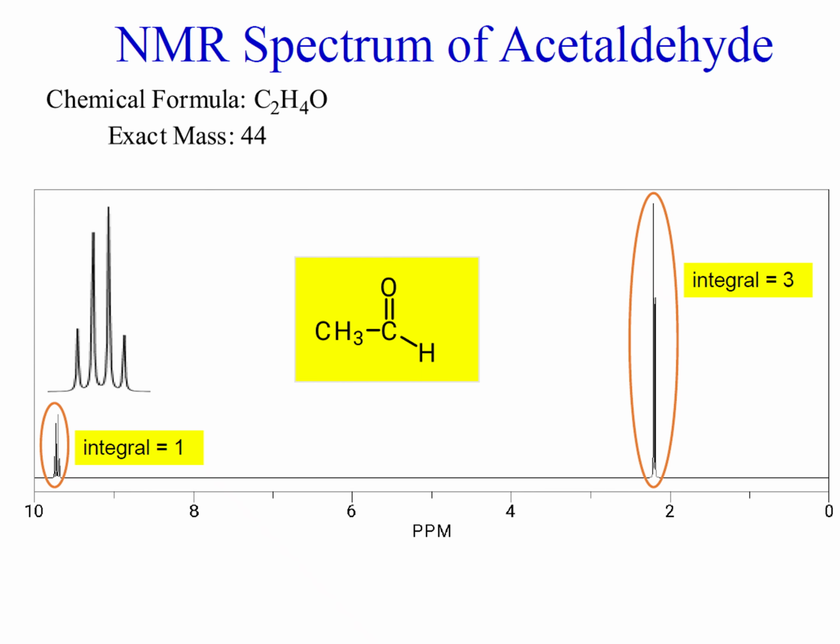That means you should take this hydrogen into consideration, and this hydrogen will have an effect on splitting. So for this hydrogen, 3 plus 1 is equal to 4, a quartet. And for this CH3 it would be a doublet. So these will also follow the rule here.